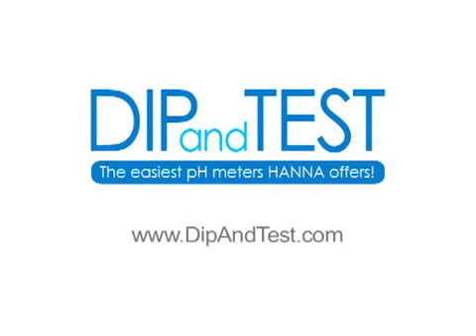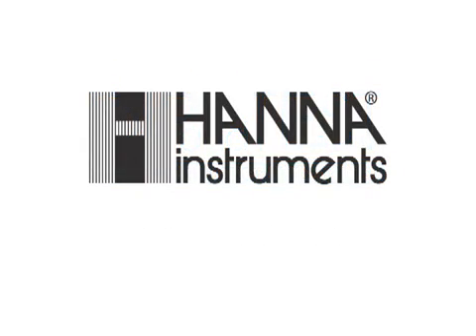Go get your HI991003N pH, millivolt, ORP and temperature meter and dip and test today.